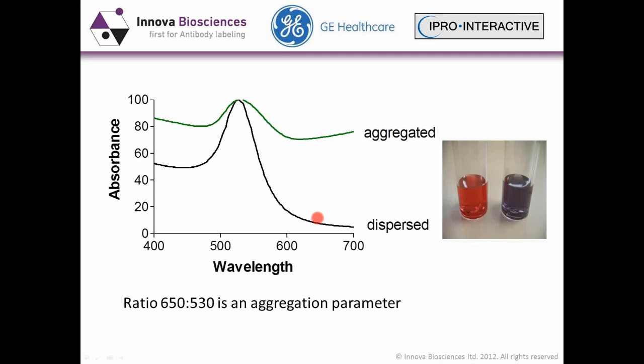At Innova, we measure the quality and dispersal of the gold colloid before we apply the coat, using a 650-530 nm wavelength scan. You can quite clearly see here that when the particles are aggregated, you get this profile and a purple color in your gold colloid. When it's properly dispersed in the solution, you get a much clearer peak and this pinky-red color.